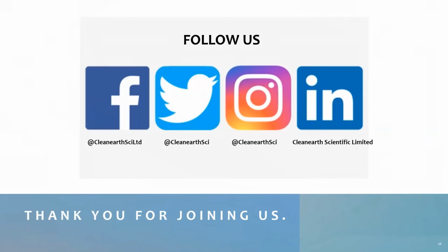Maybe I failed to mention that the tanks normally have a UV, and this is really important. It's good that you asked that question. The water purification system's reservoir tank normally has what we call an ASM module, or automatic sanitization module. Basically what is in this module is a UV lamp that controls any bacterial growth in water stored in the tank, and also protects against biofilm formation on the walls of the tank.